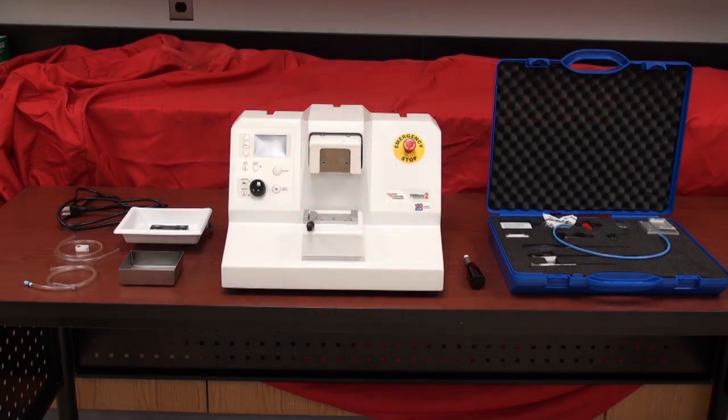Good morning. My name is Al Koritz. I'm Applications and Service Manager at Electro Microscopy Sciences. Today I'd like to show you how to set up your EMS7000SMZ2 tissue slicer. First we'll go through all the components that come in the accessory boxes, then we'll go through a step-by-step installation of all those accessories required and setting up the unit so you're able to make your first slices of your chosen tissue.